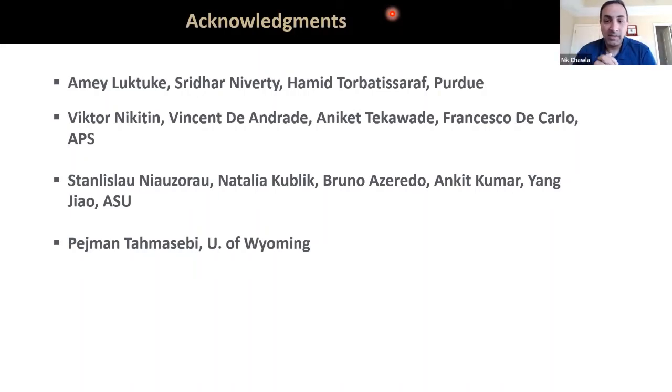And at the APS, because we have huge amounts of flux and all of these very nice tools, we can actually start to capture these events in almost real time. With some of the foam experiments, we were capturing the data with continuous loading, and the acquisition was actually faster than the loading rate. So we could truly capture the projections without any real distortion in the images. With the corrosion experiments, with the sintering, for example, we built in a bit of backfill in terms of the time. We were more on the minutes time scale, but still fairly quick, and that too at the nanoscale.